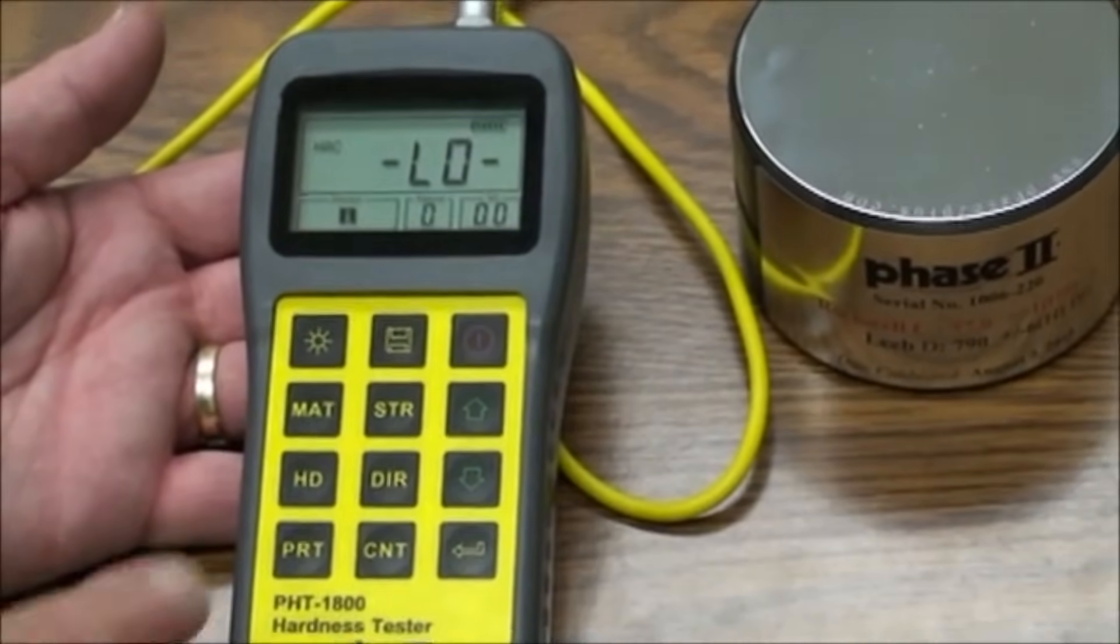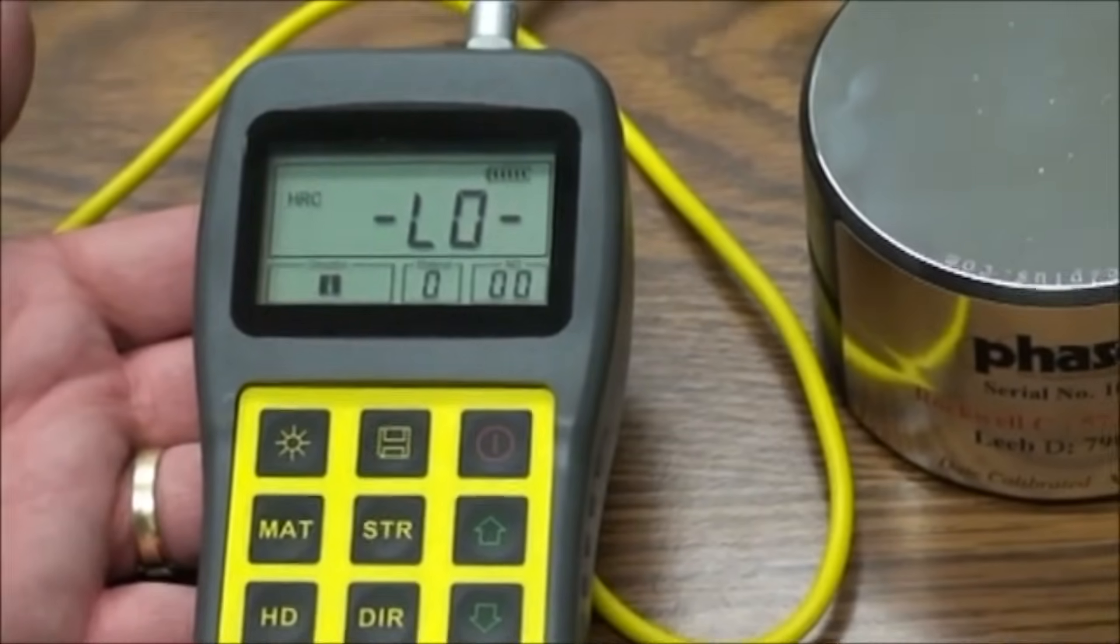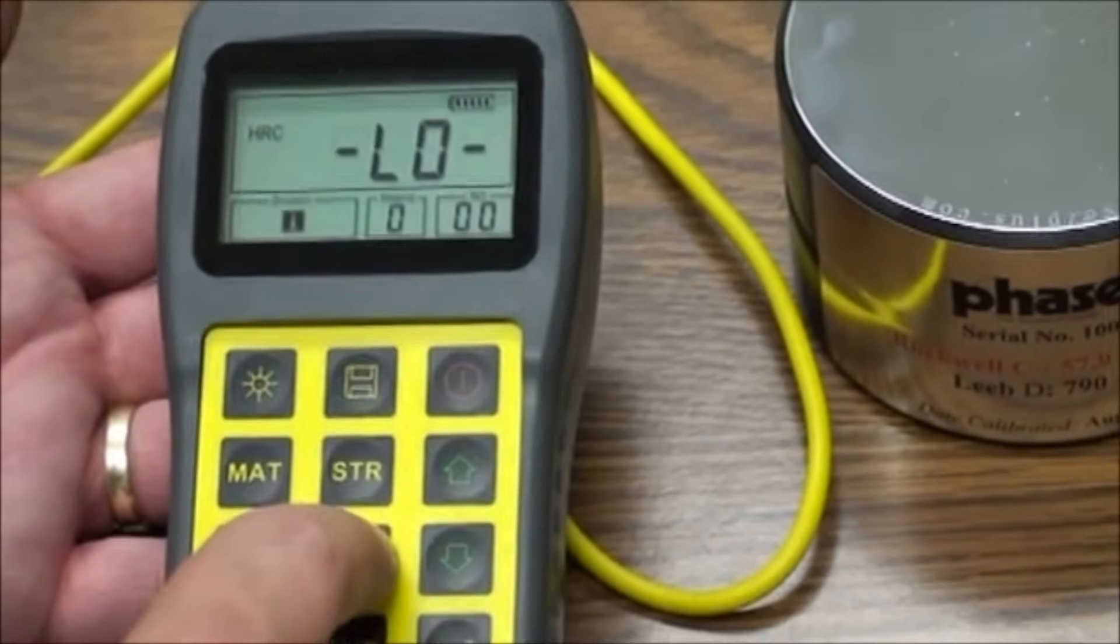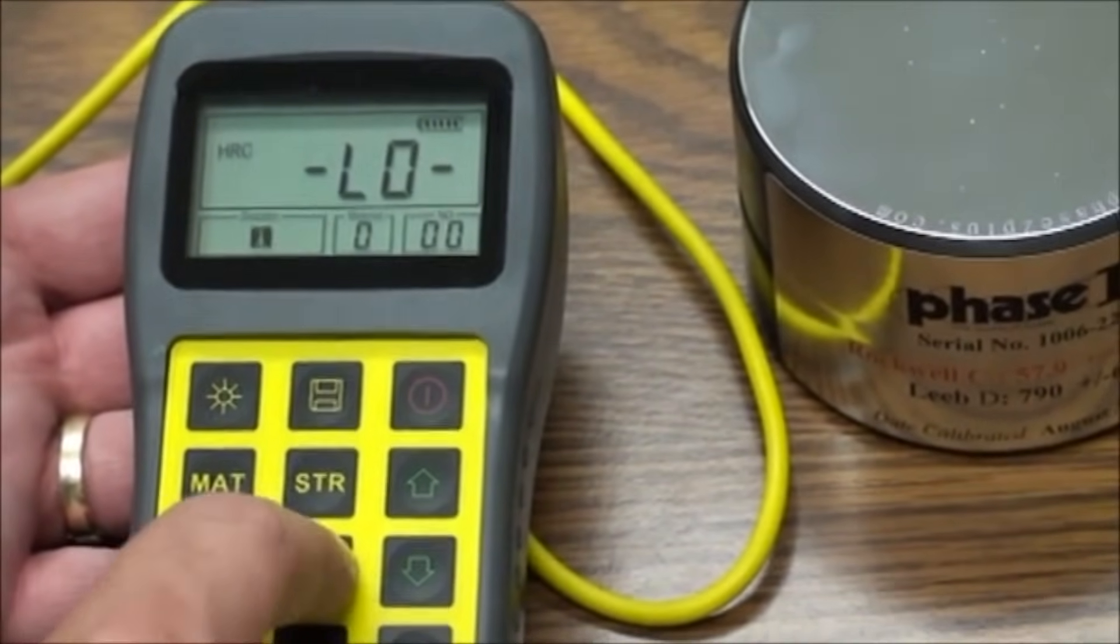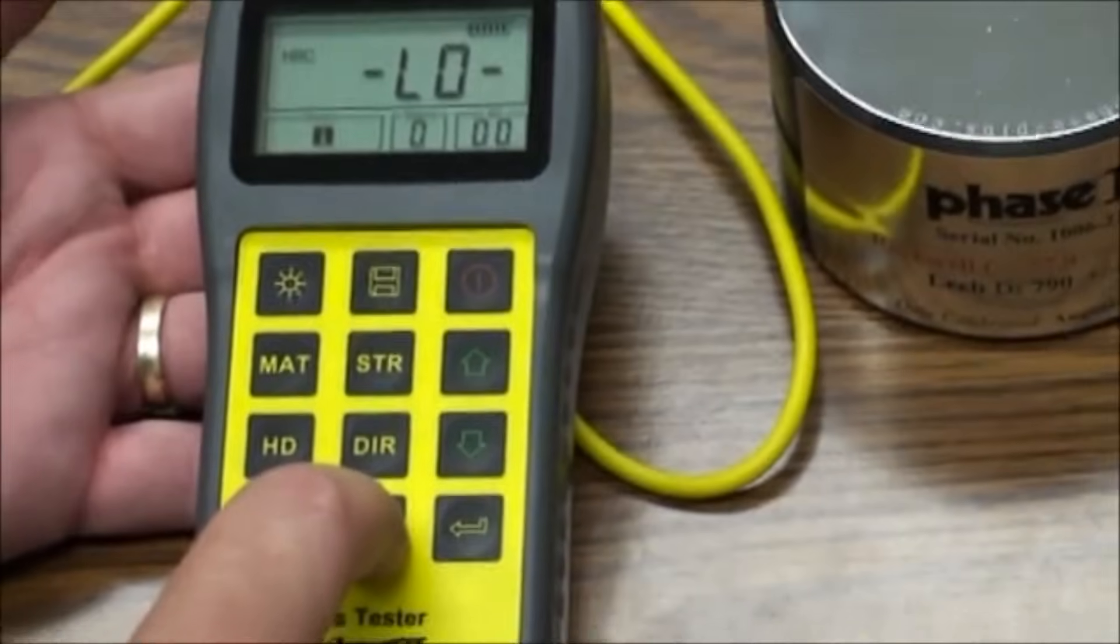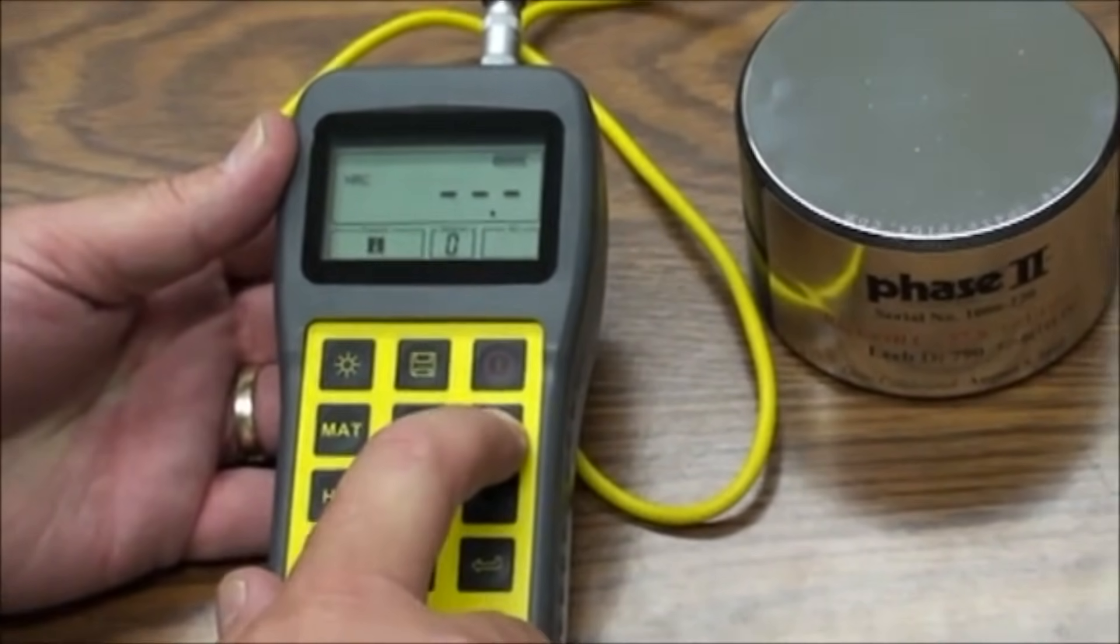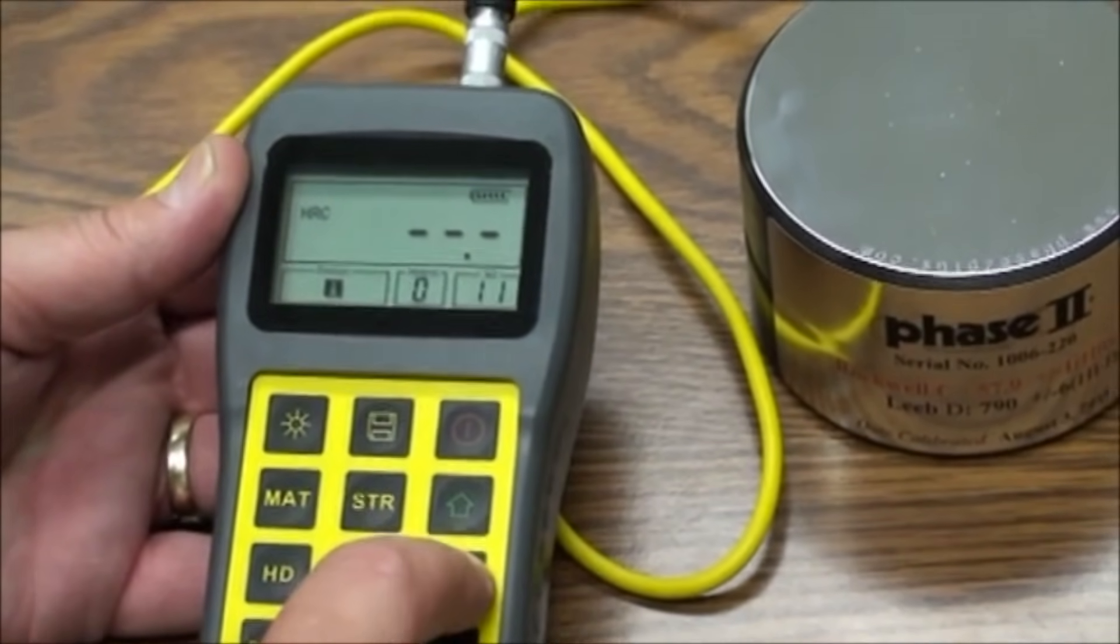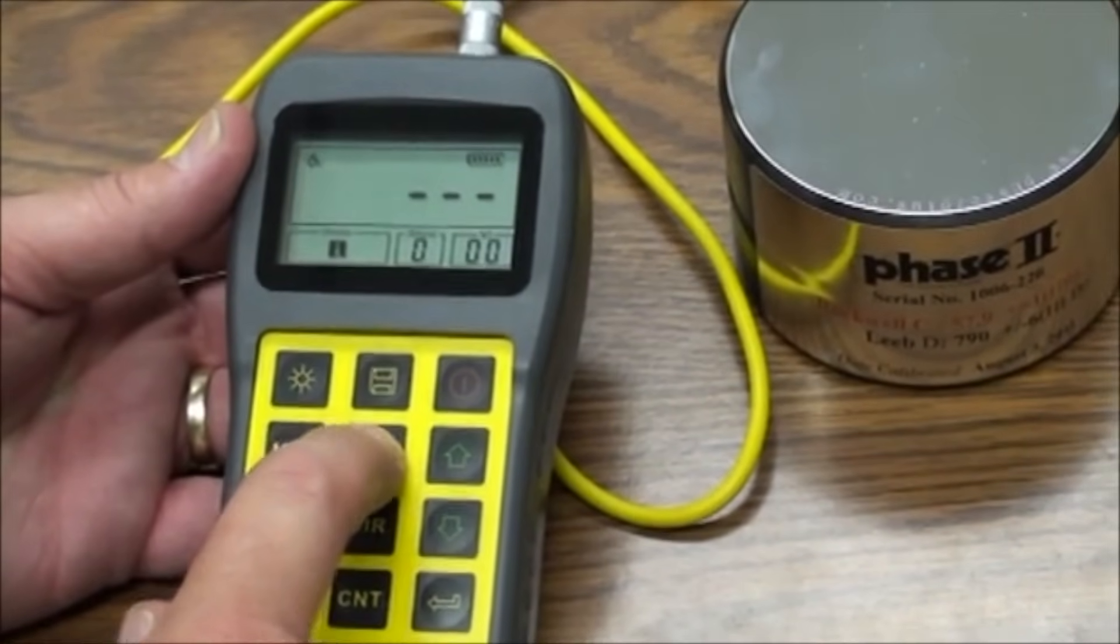The backlight key is easy to turn on and off. The DIR key is used to change the direction of the test probe during your test. The count button will allow you to preset how many tests will be taken before an average is computed.